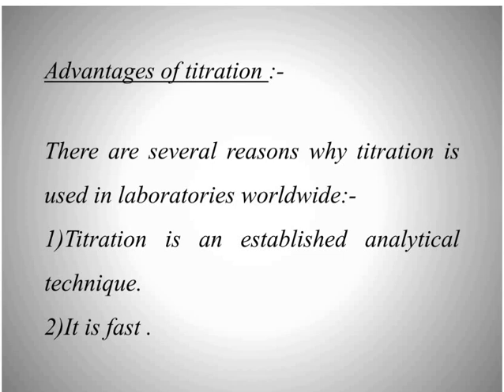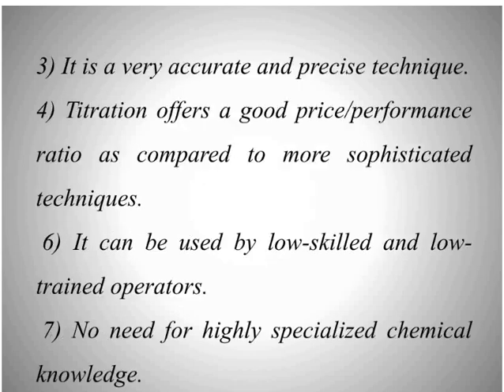What are the advantages of titration? There are several reasons why titration is used in laboratories worldwide. Titration is an established analytical technique. It is fast. It is a very accurate and precise technique. Titration offers a good price-performance ratio as compared to more sophisticated techniques. It can be used by low-skilled and low-trained operators. No need for highly specialized chemical knowledge.